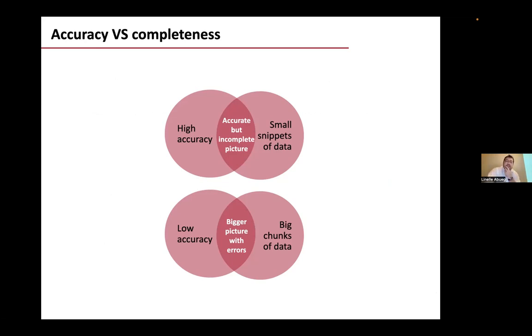So there are two ideas about Illumina versus PacBio. With Illumina, you're going to have high accuracy, but very short reads. And with PacBio, you have low accuracy in general, but a big chunk of data, very long reads. The problem of short reads is that you get an incomplete picture of the genome, but with long reads, as Judo explains today, you can be more accurate in the graph assembly and cover regions that you couldn't have done with short reads.